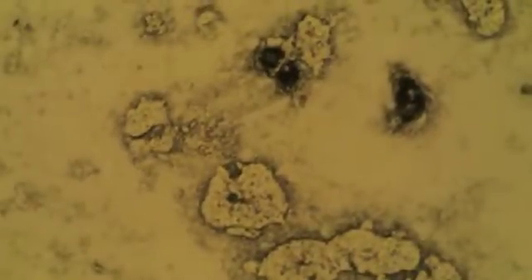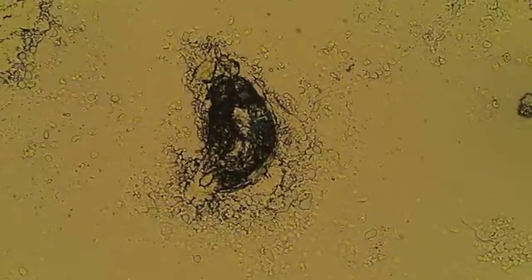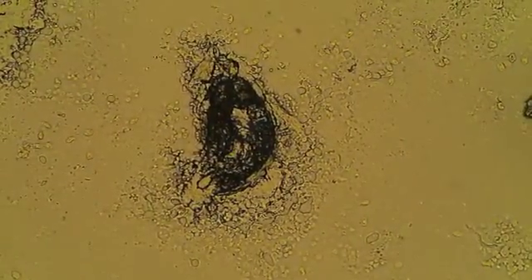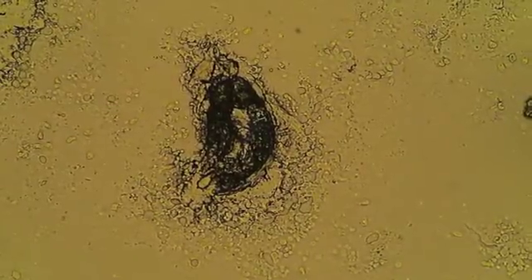Let's focus in and have a closer look. Now we're at ten times objective. When we focus here, with the condenser off and then back in, you can start seeing the detail of what is actually on there. You can see that this is the structure of a metazoan creature.